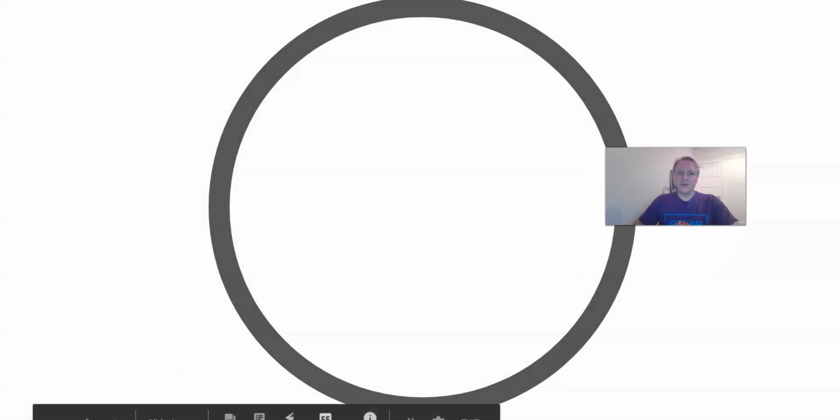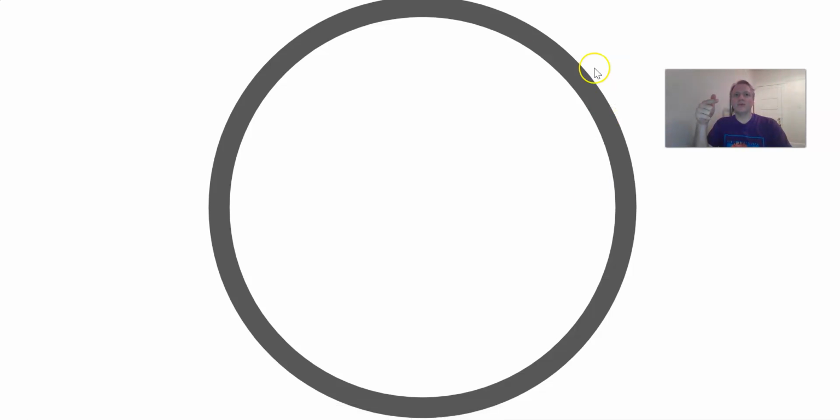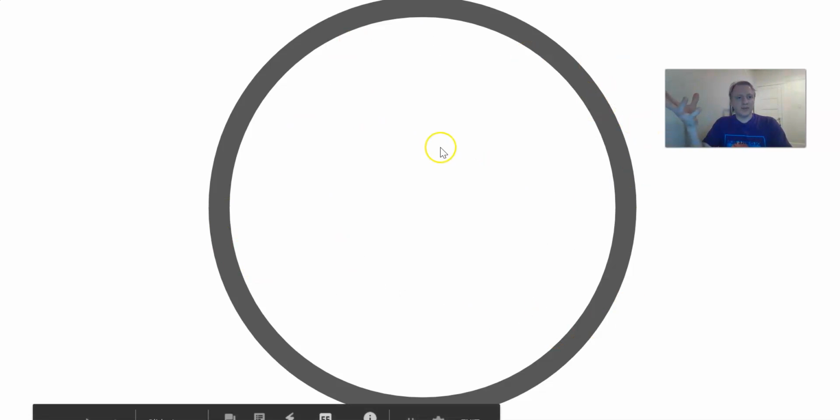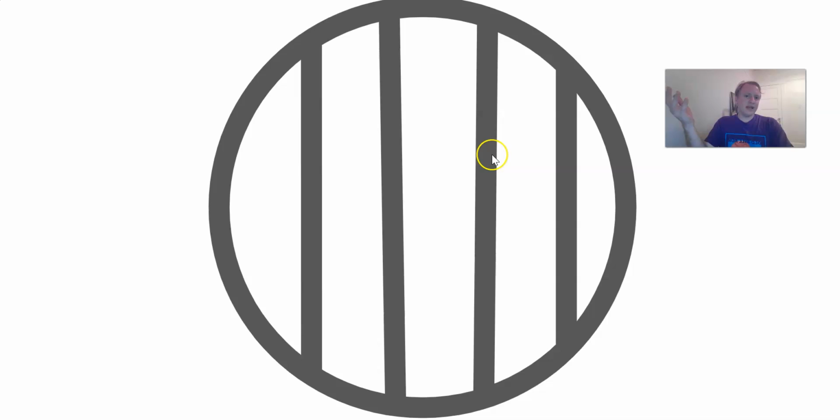Anyway, so when you're looking at your scope, let's pretend you've got your oculars all set up and you're looking into your scope. You should see a bright circle, something like this. And then you get it into focus and you should be able to visualize whatever it is that you're trying to look at. In order for you to estimate the size of this circle, what I want you to do is physically take your ruler, or you can use the one that I sent to you that you can print out. I want you to physically take that and put it onto the stage, underneath the slide clip.